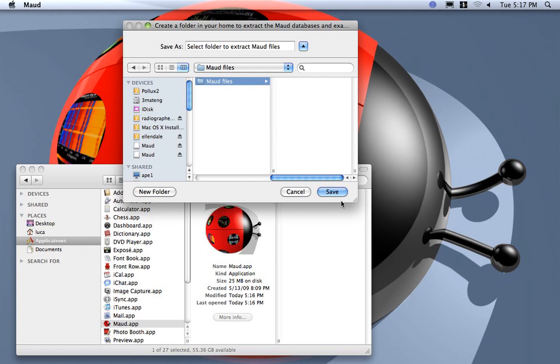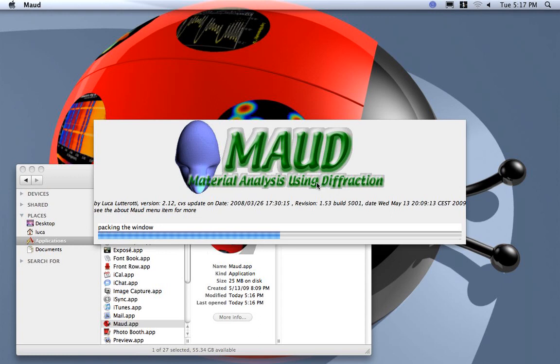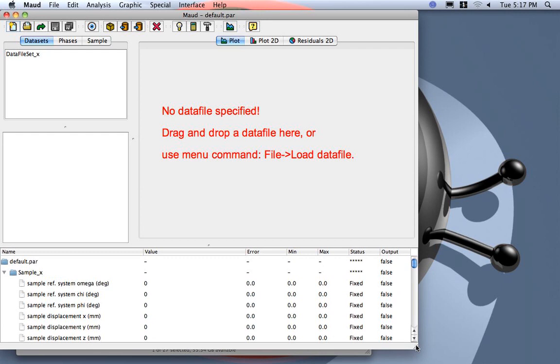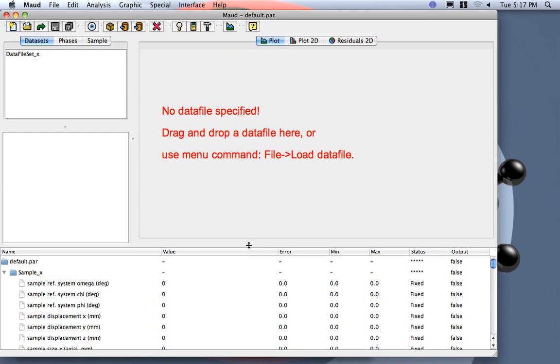Save. So it extracts everything in that directory and starts the program. I adjust the window to my preference so I can see quite well what I need.